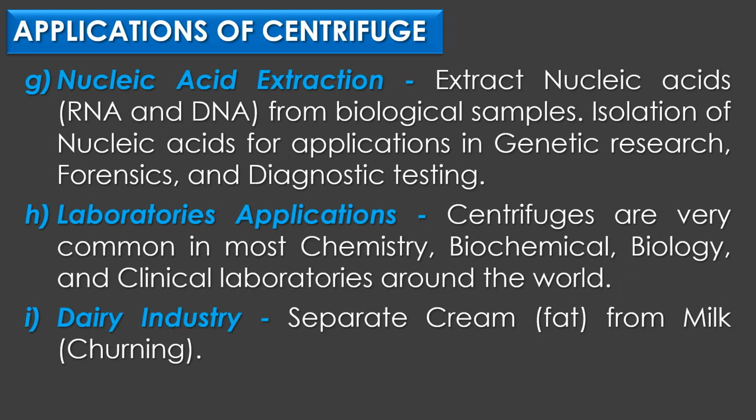The seventh application of centrifuge is nucleic acid extraction. Centrifuges are instrumental in extracting nucleic acids, including RNA and DNA, from biological samples. By separating cellular components, centrifuge aids in the isolation of nucleic acids for applications in genetic research, forensics, and diagnostic testing.